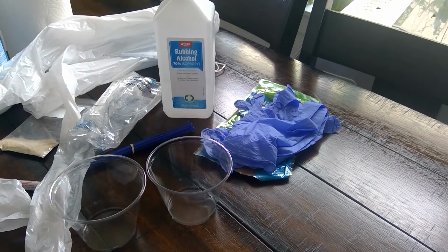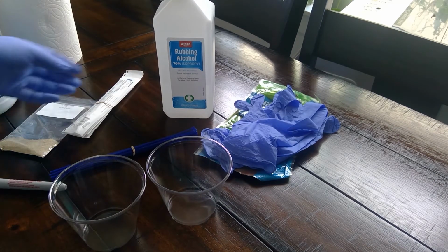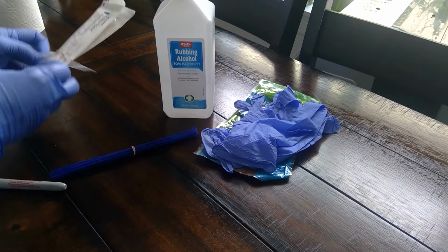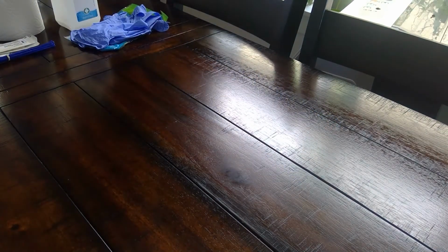Alright, so wash your hands thoroughly with soap and warm water, and then put on gloves, goggles, apron, and a face mask. Alright, so now we will push these things to the side, and we'll sterilize our workspace.